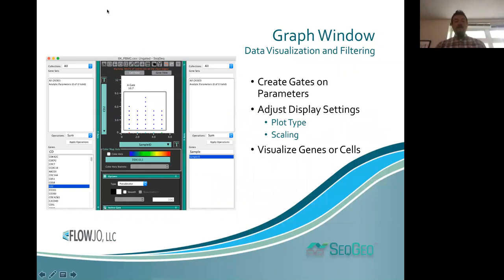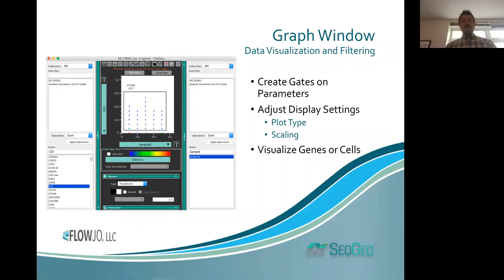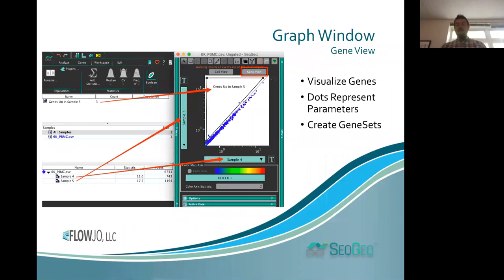To begin your analysis, you'll often want to open up a graph window, which is as simple as double-clicking on a sample or population. You can visualize different parameters within that space, and subset your parameters into what we call gene sets, listed at the top of the X and Y wings. You can also change the plot type, and scaling is available for customization via the T button next to either axis.